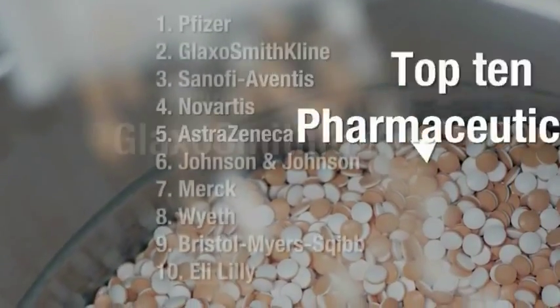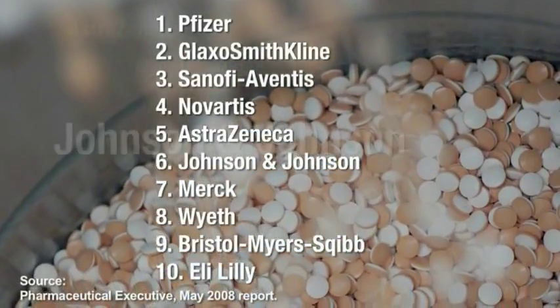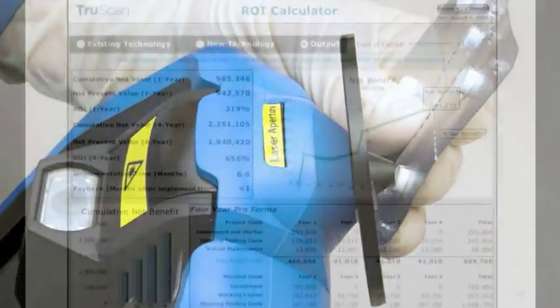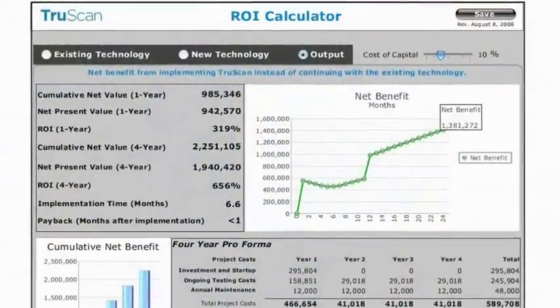Eight of the top ten international pharmaceutical companies use TruScan. Typically over a four-year period, TruScan users will see a 250% return on investment.